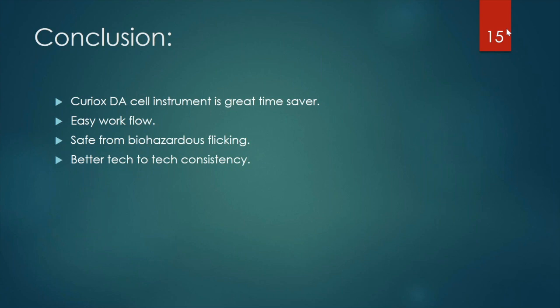And in case, at that time, you see there are some wells where there's still a droplet sitting there, it had happened sometimes. For that, you will have to do some kind of maintenance, which is very easy. I could do it myself, but it rarely happens. If at all that happens, you could do it, or you call tech support.